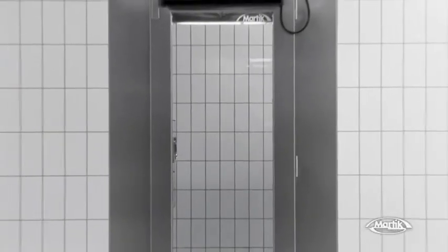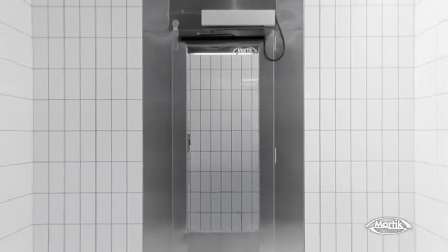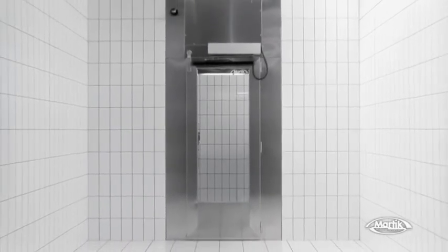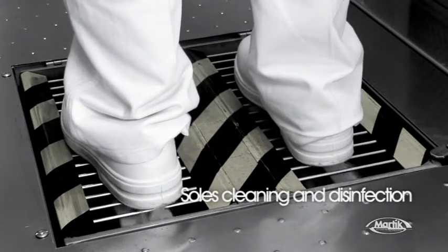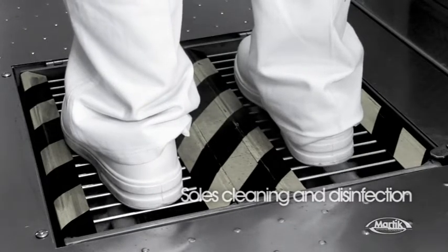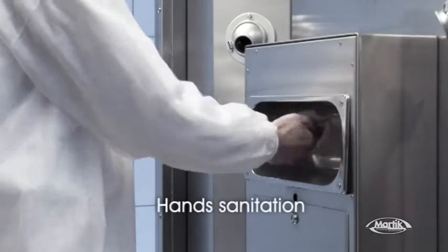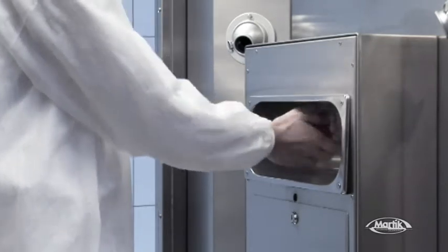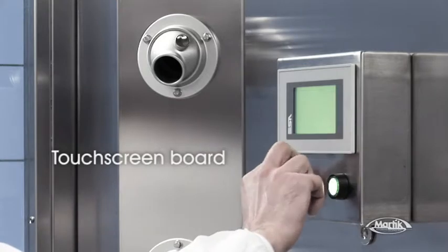Airtek is combined with Pulley-Tek, our special sterilizing system for shoe soles and hands, making it a unique instant hygiene machine. Pulley-Tek brushes and disinfects shoe soles. In the meantime, a nebulizer cleans your hands, which means no more gloves nor foot protections are needed. The whole equipment is operated by a programmable control touchscreen.